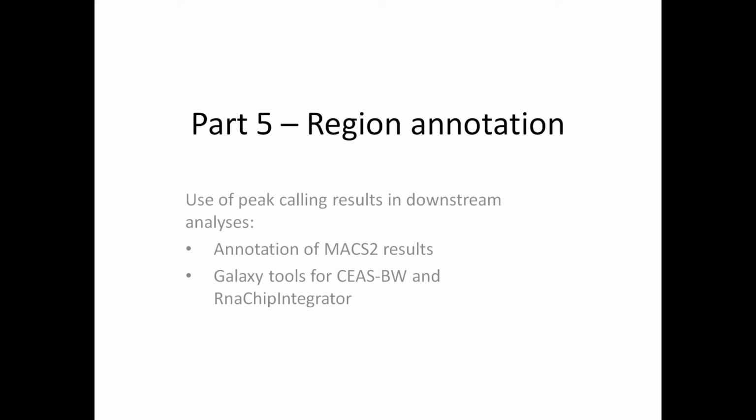But before we can get going, there is one small problem. The format of the results files from MACS2 are not directly compatible with the new tools. But fear not, within Galaxy I will show you how to extract the data we need in just a few steps.